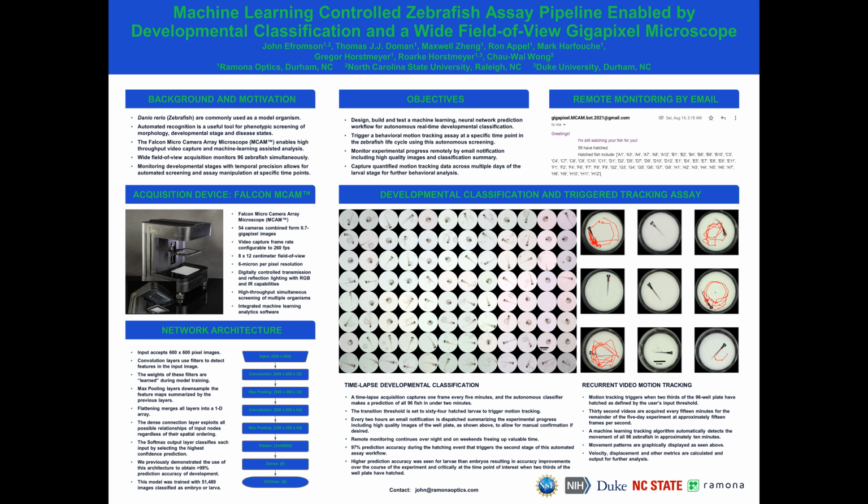We couple this software with a novel imaging platform termed a micro-camera array microscope, or MCAM, to simultaneously image and analyze all wells in a 96-well plate at high resolution. Initially, in time-lapse mode, the MCAM captures 0.7 gigapixel snapshots of all 96 zebrafish embryos every 5 minutes, and their transition to the larval stage is qualified using a convolutional neural network.